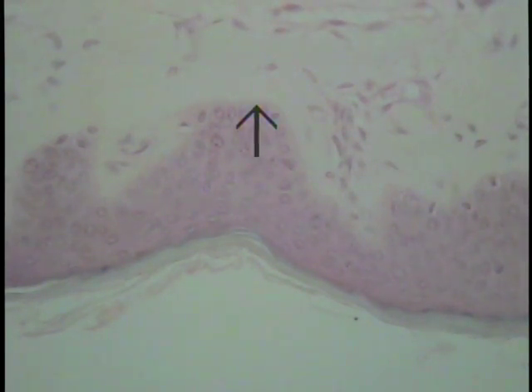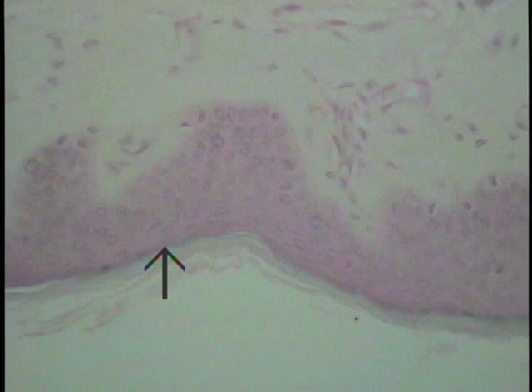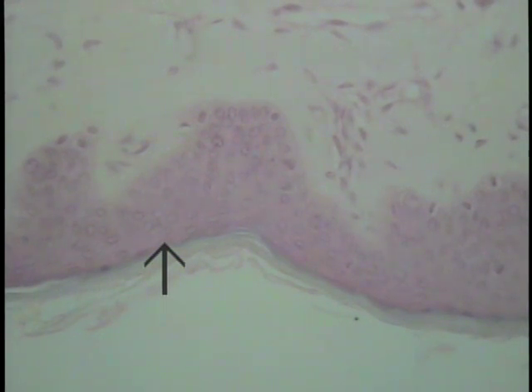Once again, remember the classification scheme. Multiple layers of cells, so it is stratified. These cells change shape, and once they approach the surface become flat and plate-like, and therefore it satisfies the definition of a stratified squamous type of epithelium.